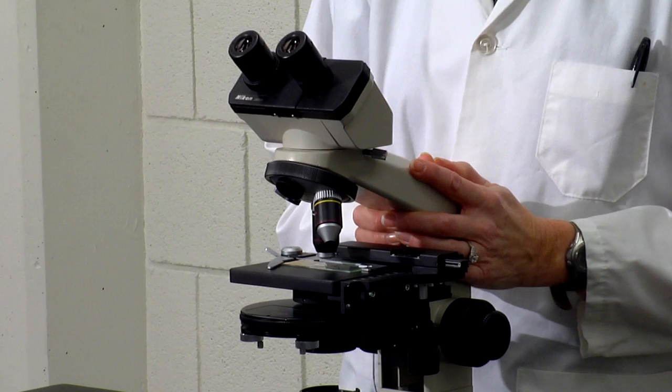This particular compound microscope can also be used for other types of microscopy, including dark field and phase contrast. If you wanted to view a live sample, you could make a wet mount and then use either the dark field or phase contrast.